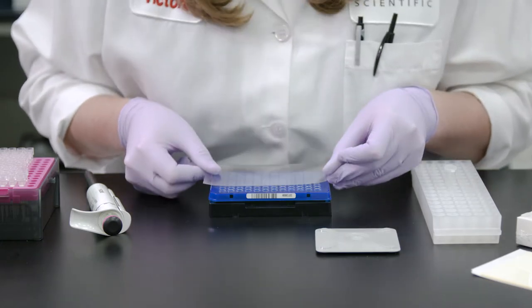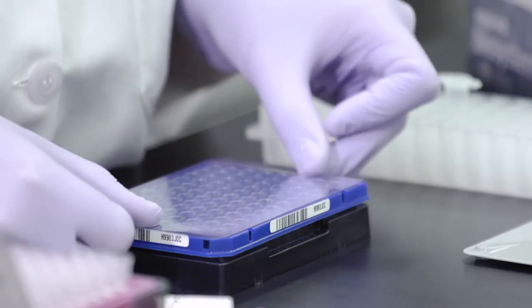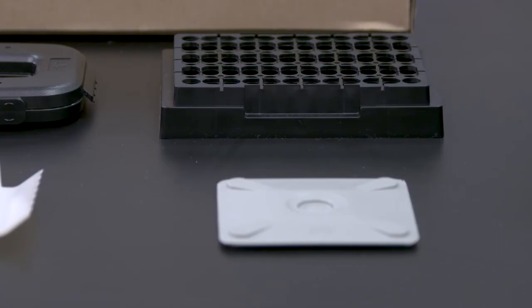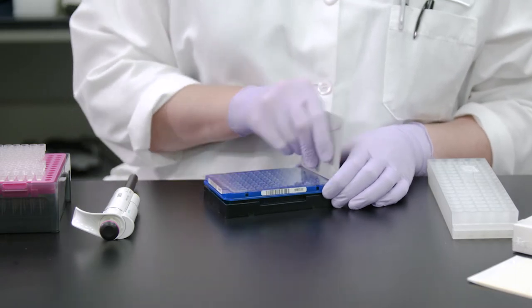Next, align the adhesive film on the plate so that all the wells are covered. Using the adhesive film applicator, press and move the flat edge of the applicator back and forth along the short edge of the plate.